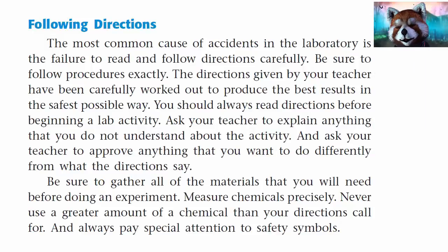Following directions. The most common cause of accidents in the laboratory is the failure to read and follow directions carefully. Be sure to follow procedures exactly. The directions given by your teacher have been carefully worked out to produce the best results in the safest possible way. You should always read directions before beginning a lab activity. Ask your teacher to explain anything that you do not understand about the activity. And ask your teacher to approve anything that you want to do differently from what the directions say.